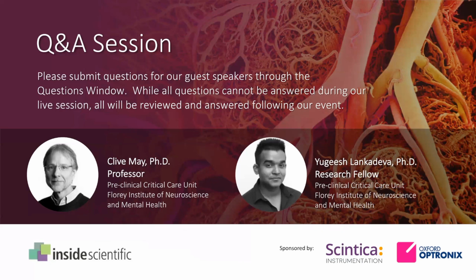Okay. And then Clive and Yogesh, maybe Michael, you might be able to join on this question as well. I know Clive and Yogesh, you mentioned that you've reused the probes in the past, but is there an anticipated lifespan on them, or how long can you reuse them? Is it a one-time thing, or can you reuse them many times?